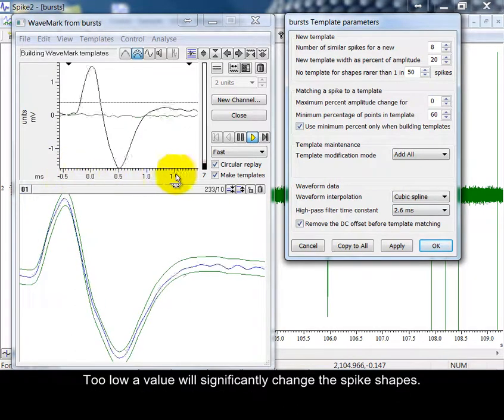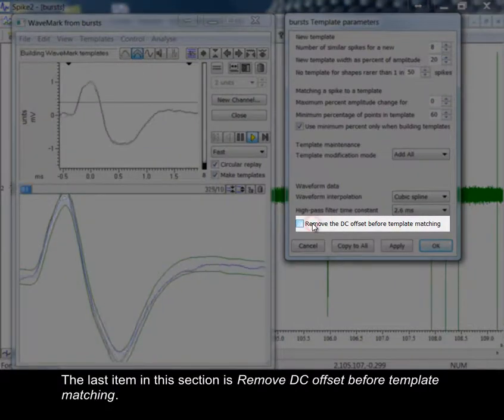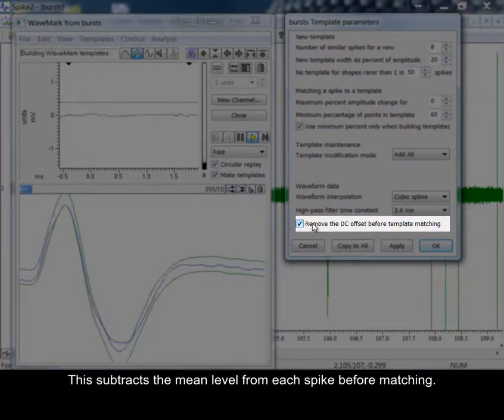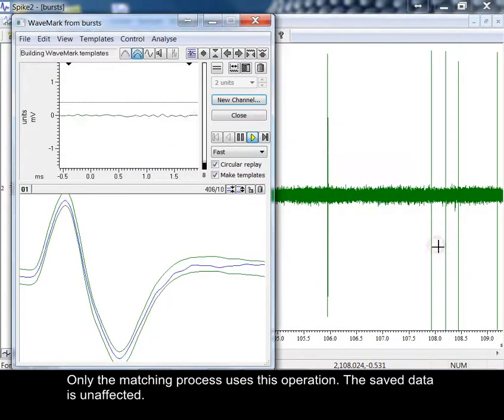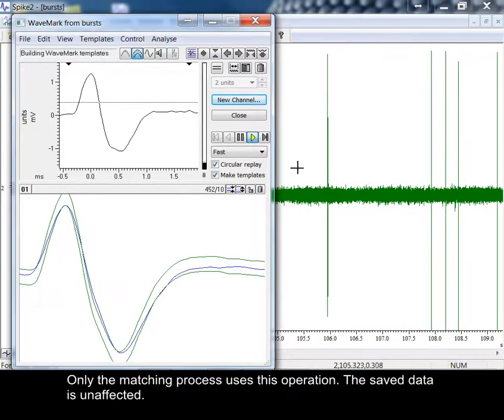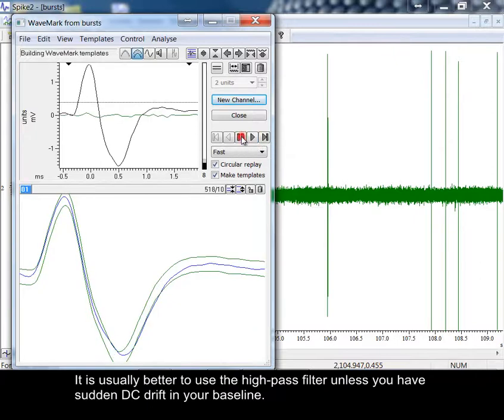Too low a value will significantly change the spike shapes. The last item in this section is remove DC offset before template matching. This subtracts the mean level from each spike before matching. Only the matching process uses this operation. The save data is unaffected. It is usually better to use the high pass filter unless you have a sudden DC drift in your baseline.